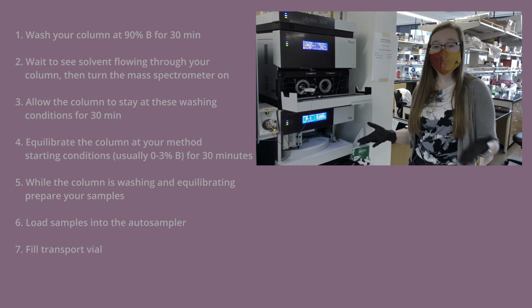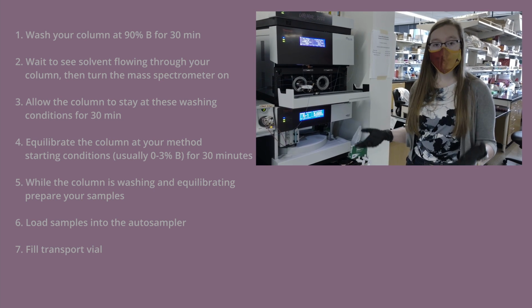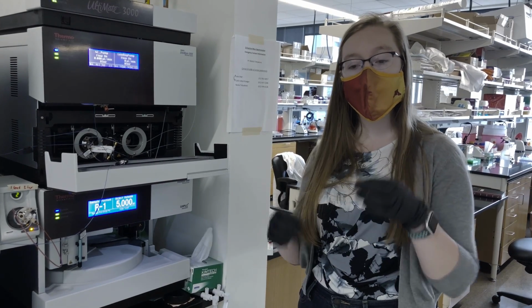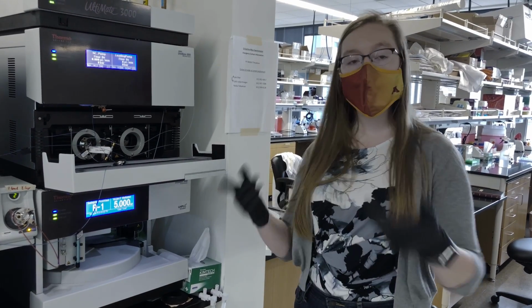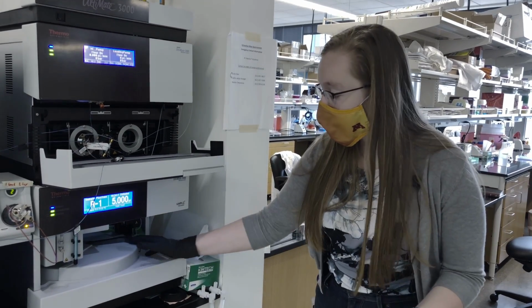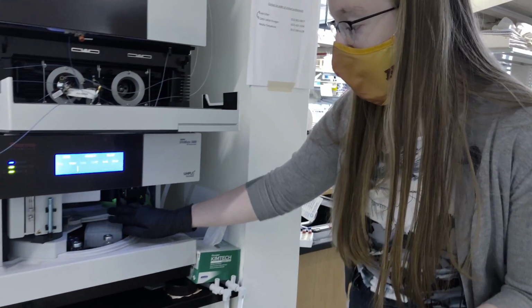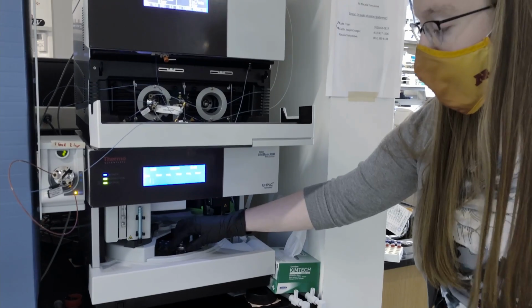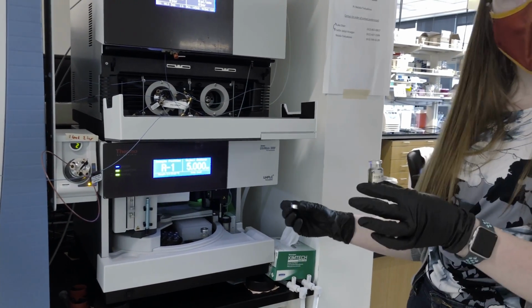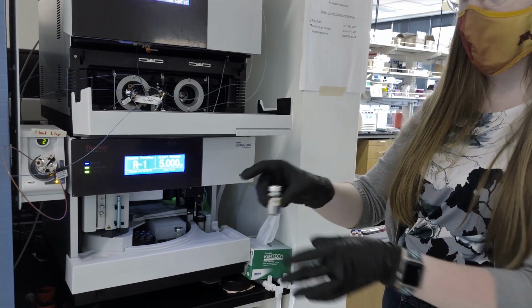Additionally, there will be some extra buffer A left that you set aside at the beginning of this protocol, and you'll want to use this to fill your transport vial. This is a vial of solvent that the instrument will use to pull up before and after your sample to clean out the needle and the injection loop, and you can also use it to inject your blanks from. My method will use vial R1, so I'll locate R1, empty out whatever is in it, and fill it up with that extra buffer A that you saved behind. I've already done this, so I'm just going to replace this vial.